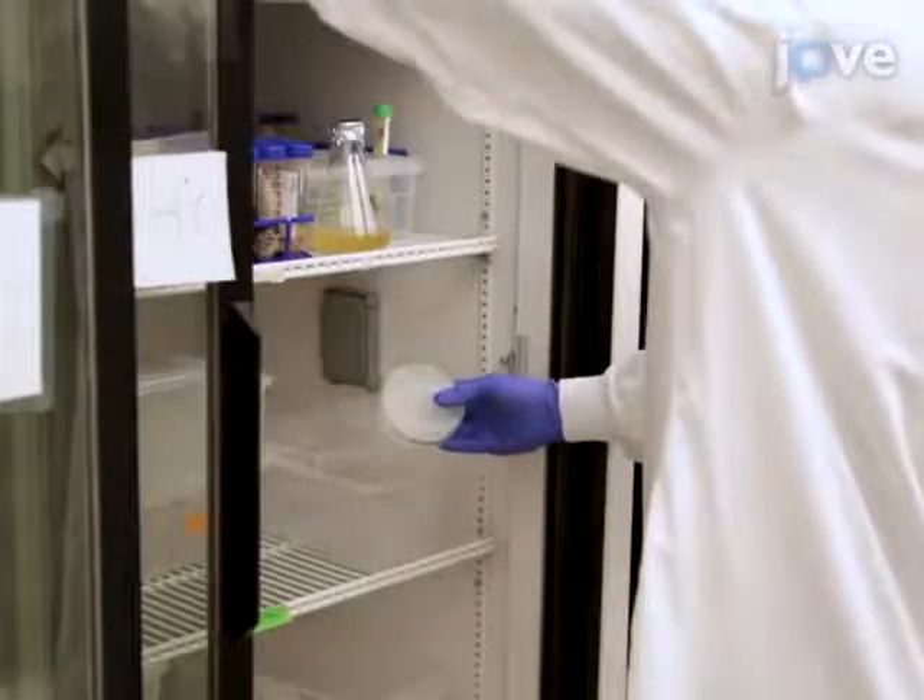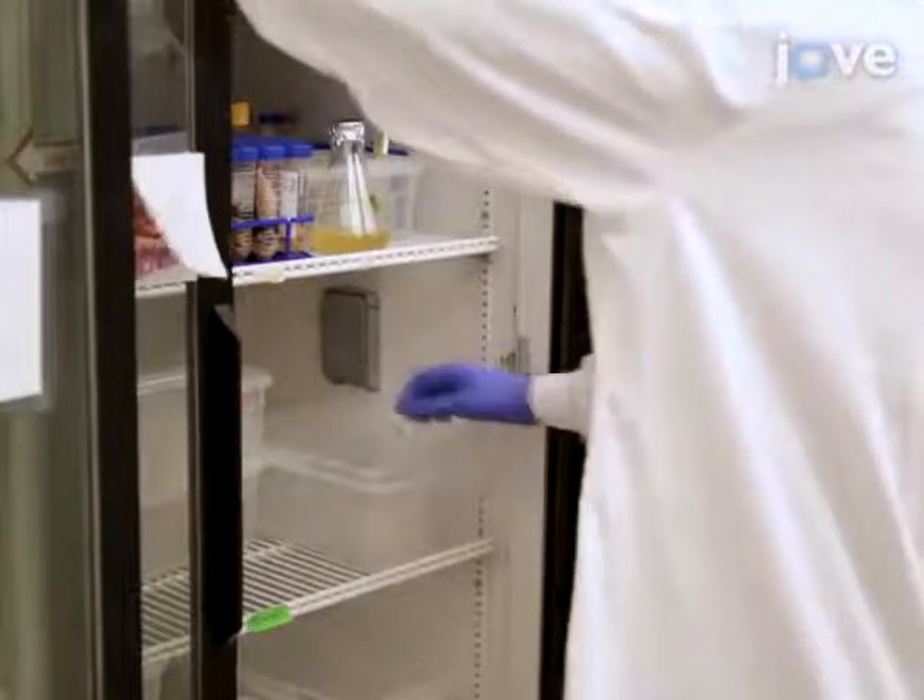When the mass culture plates have dried, store them at 4 degrees Celsius for up to 2 weeks.